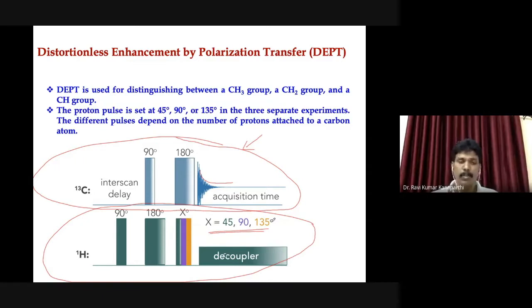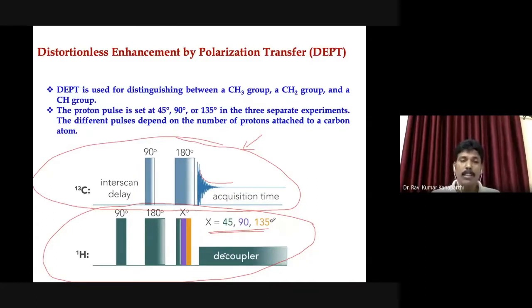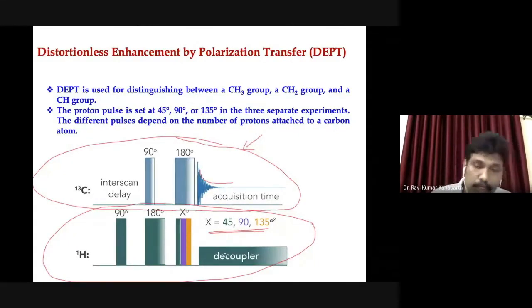So one way is that, given a task, I will press one key and record that sound with my ear and note it down. Then I will press the second key, then record the third key, the fourth key, etc. All the 64 keys I will be pressing, and then I will be recording the sounds. That is one way, which we can correlate with the simple old scanning methods, the field sweep or frequency sweep method.